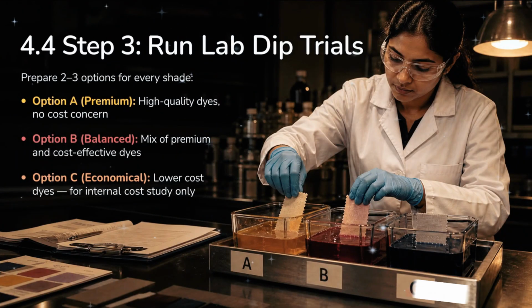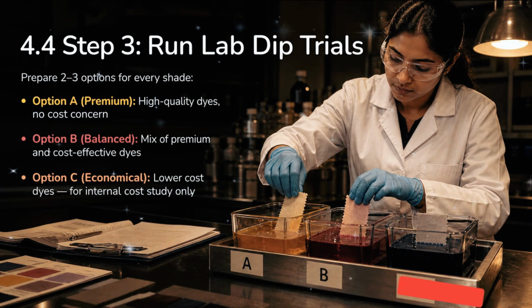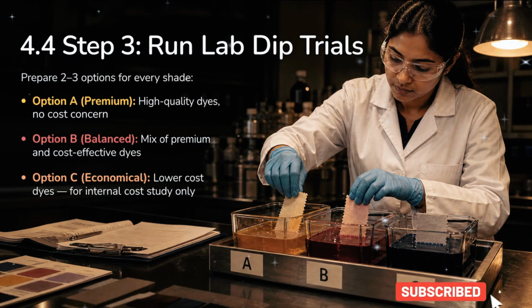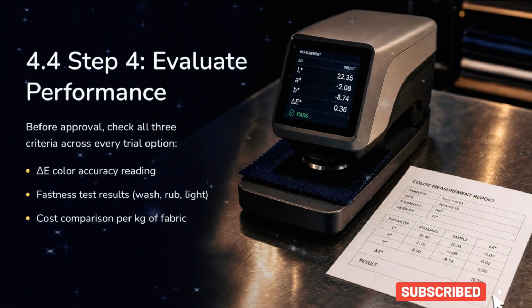Step 3 involves running lab dip trials. Prepare 2 to 3 options for every shade. Premium, high-quality dyes. Balanced, mix of premium and cost-effective dyes. And economical, lower-cost dyes for internal study. Step 4 is to evaluate performance.